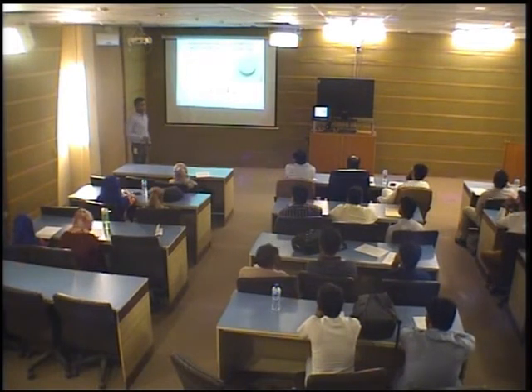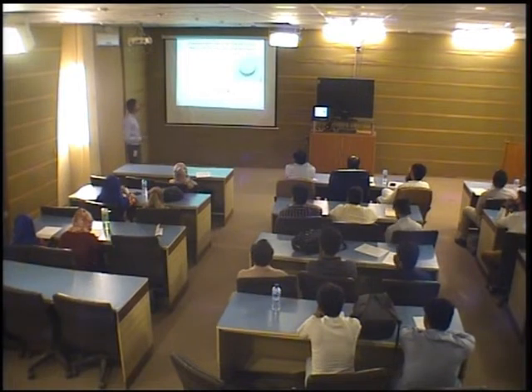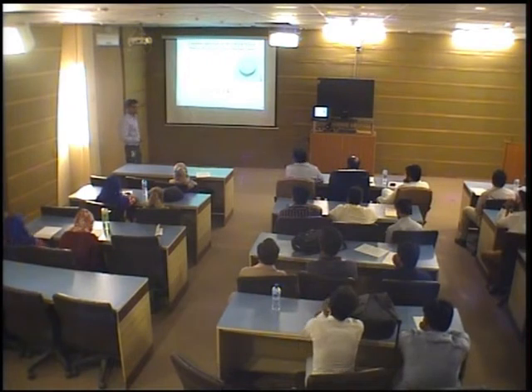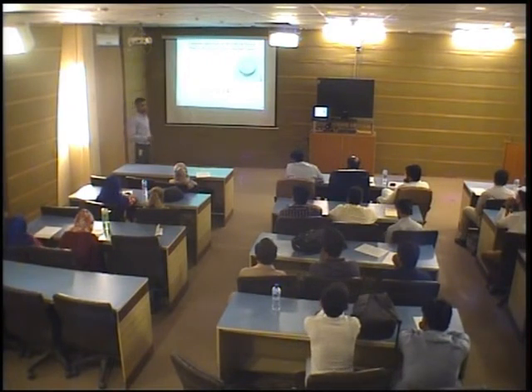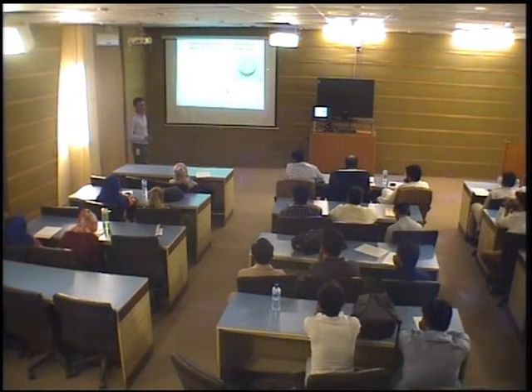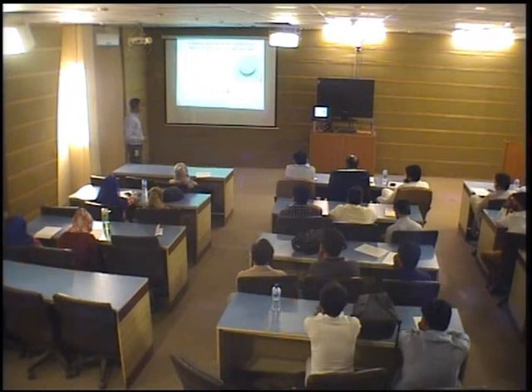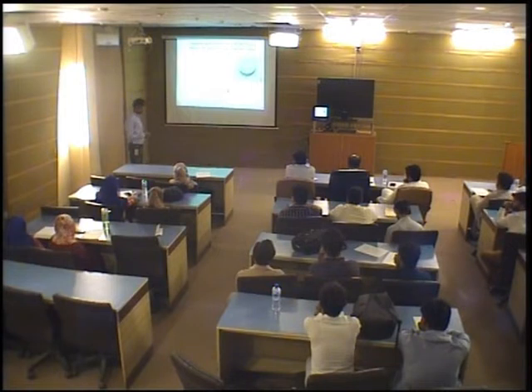While in the second set of experiments, this is the emission spectrum of talcum powder plasma produced by a 1064 nanometer laser. This is again our talcum powder sample. The spots clearly show that these are the laser spots or laser shots. We have again taken multiple data and finally we have an average of all data. This is the average spectrum. It ranges from 300 to 780 and this whole spectrum is further divided into portions.